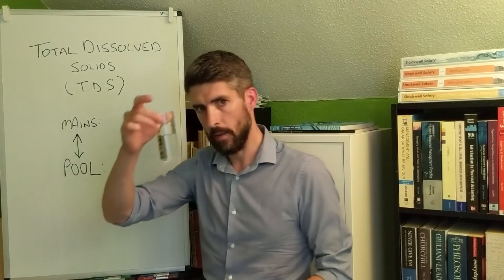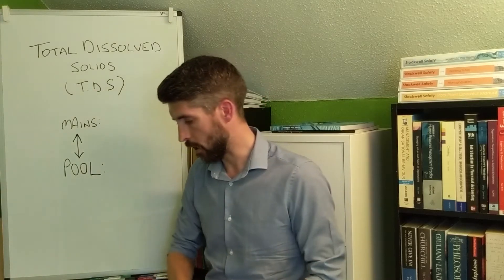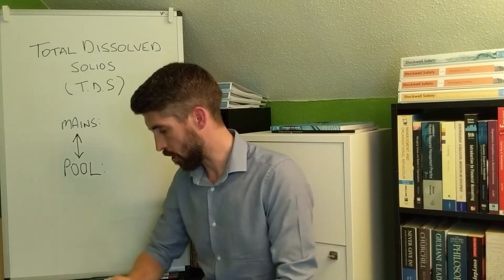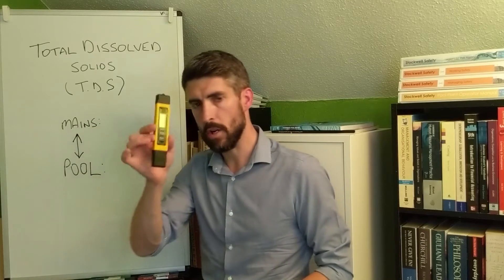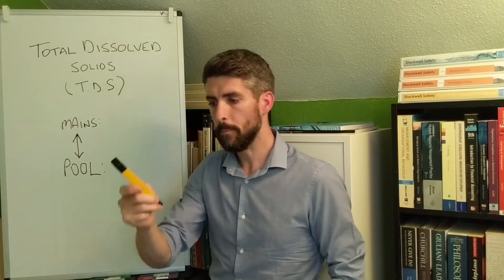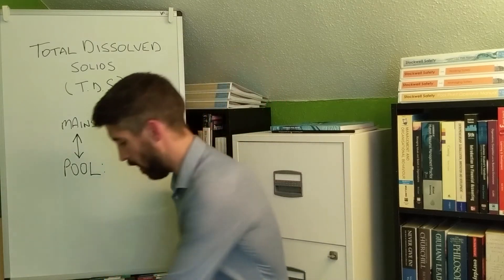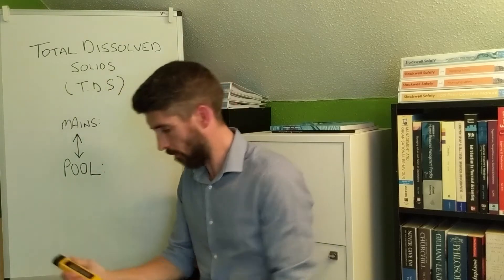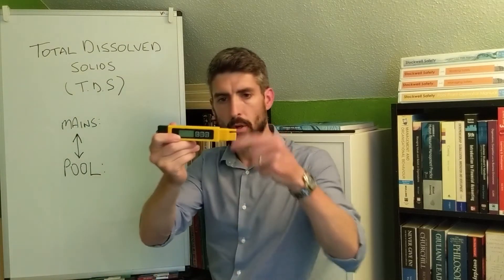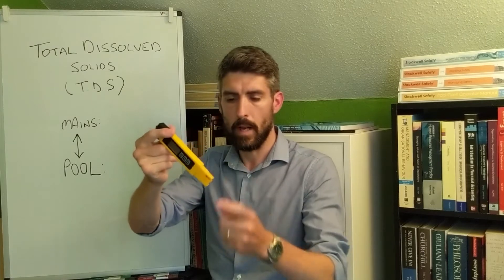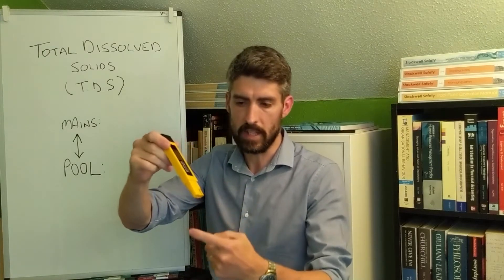So here I've got a sample of mains incoming water and I'm going to show you how to test for it. What you use is what's called a TDS meter. You take the top off and you've got the measuring end of things here.